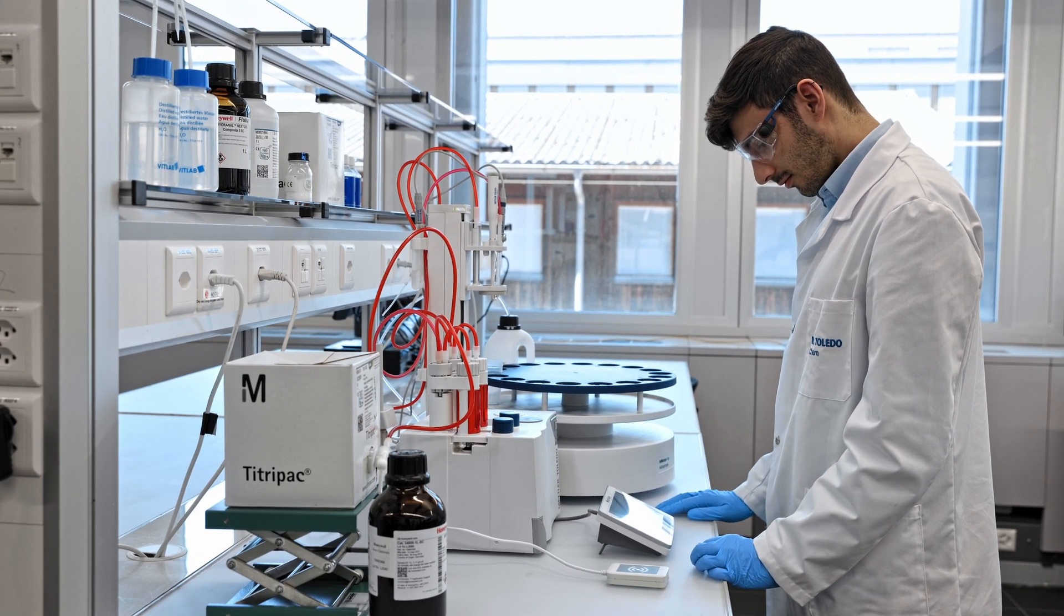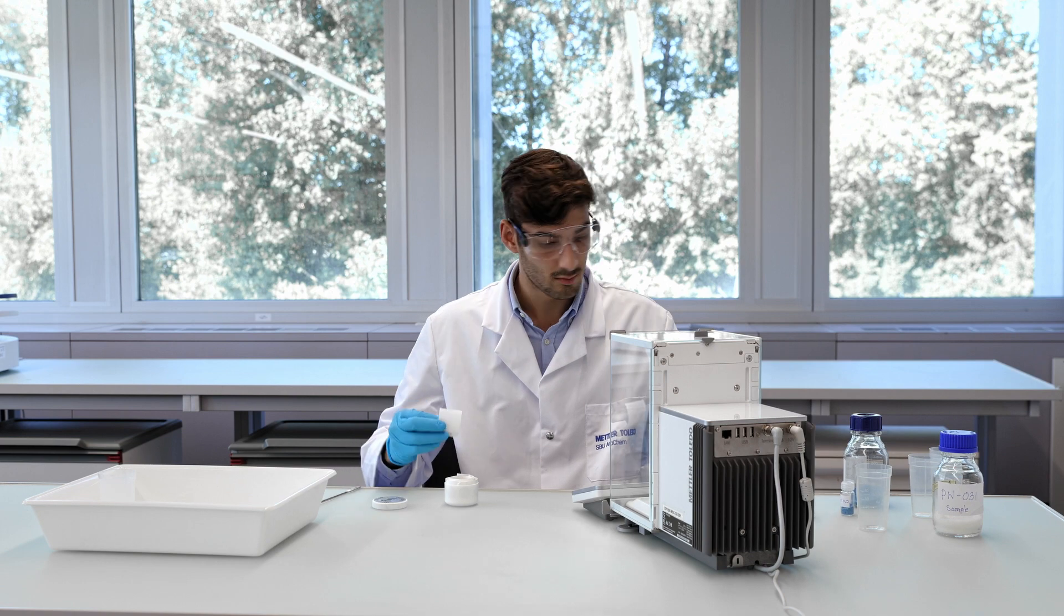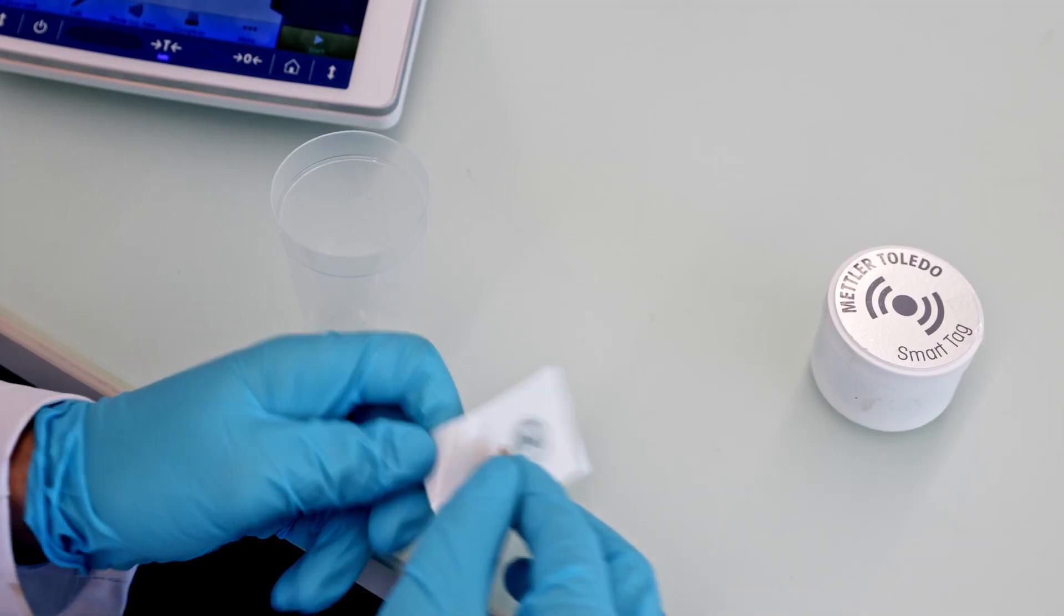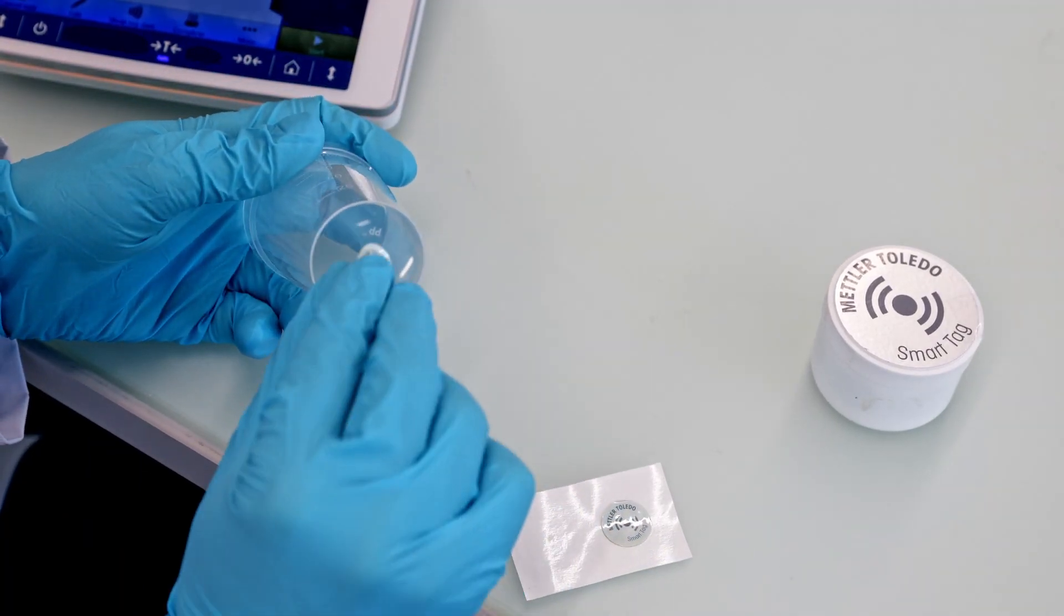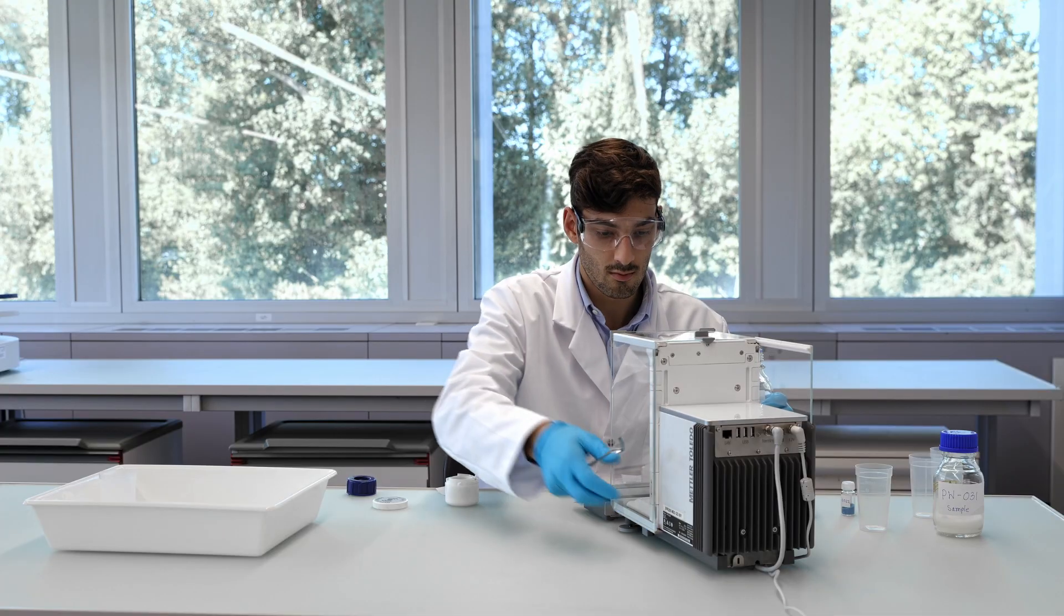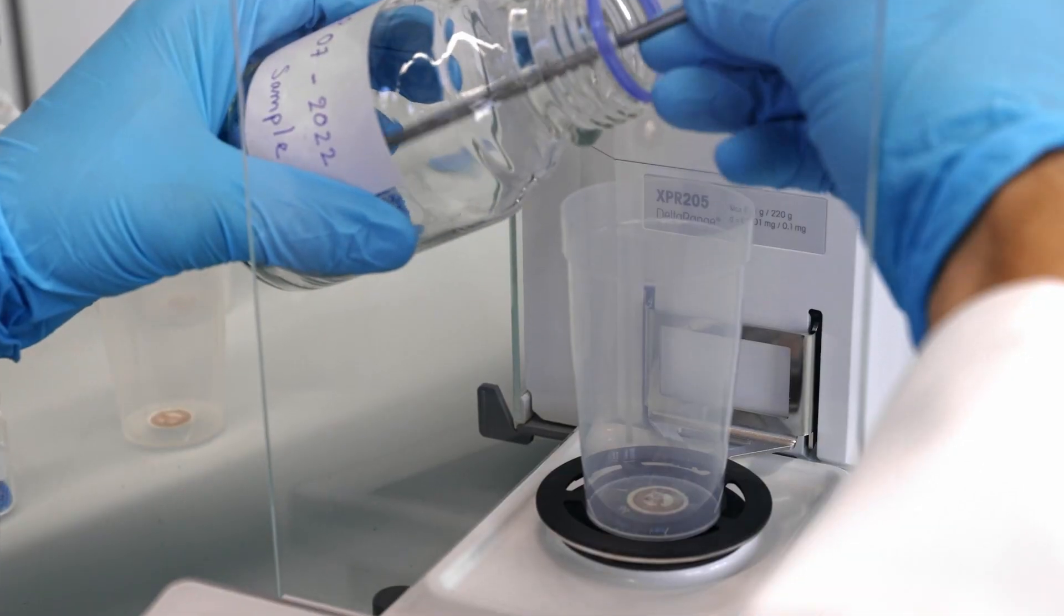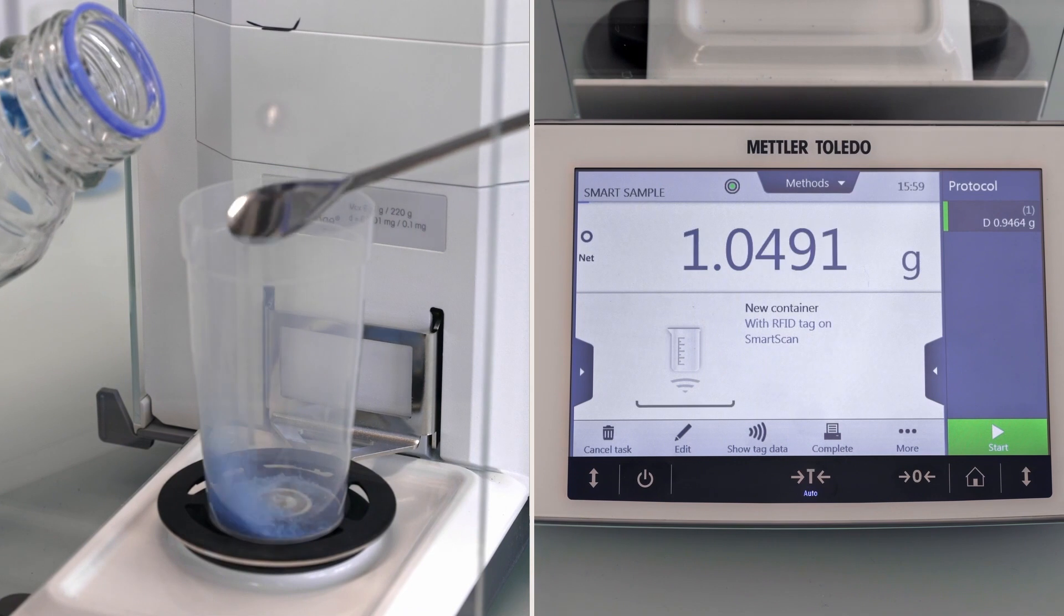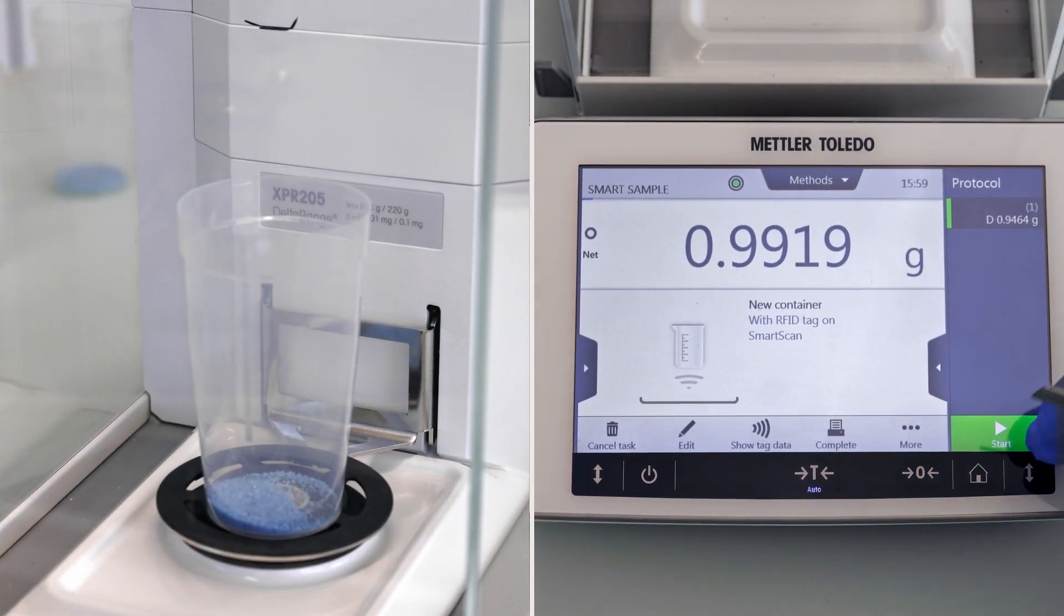Sample preparation has never been so straightforward. Simply attach a smart tag to your titration beaker and weigh your sample on a Mettler Toledo XPR balance. Smart sample RFID technology joins the balance and titrator together in one seamless workflow.